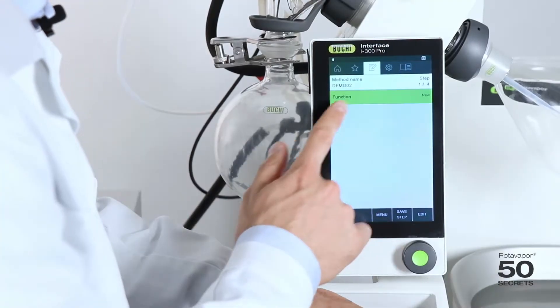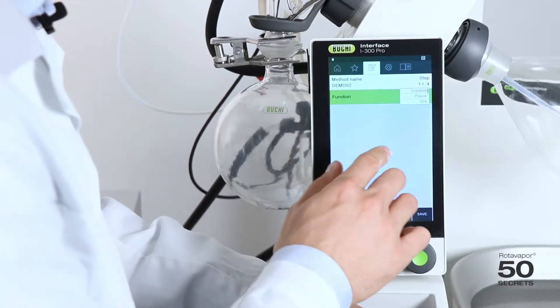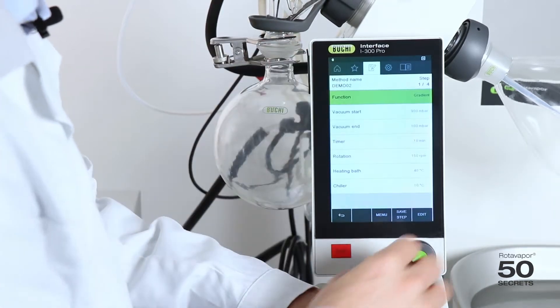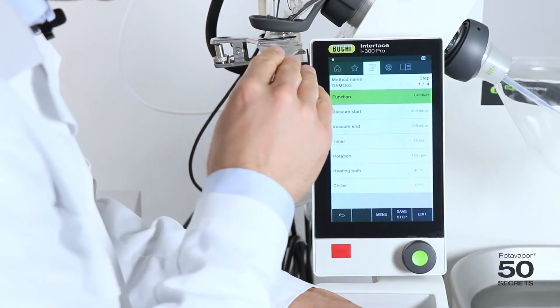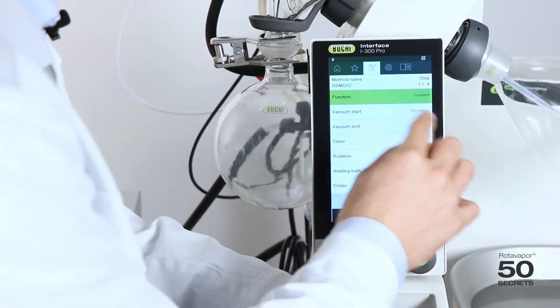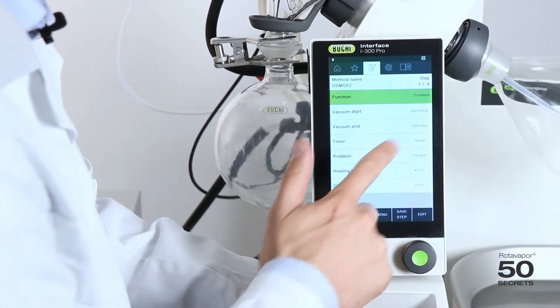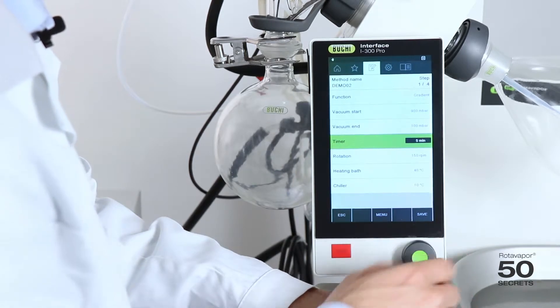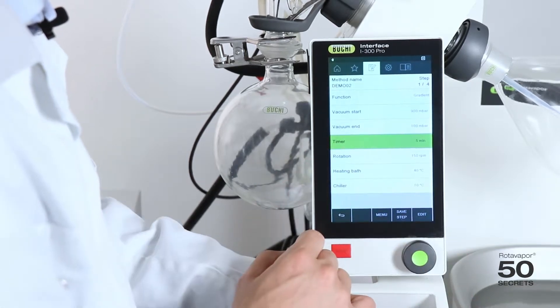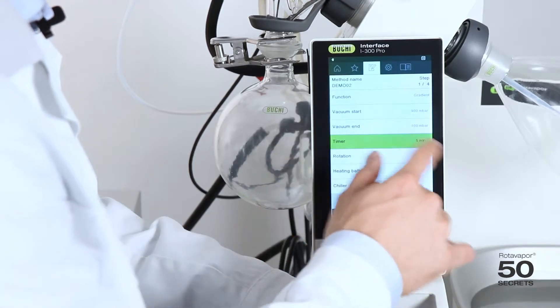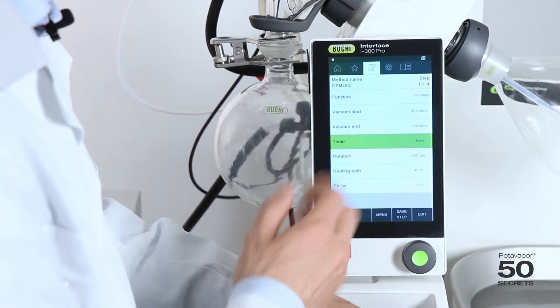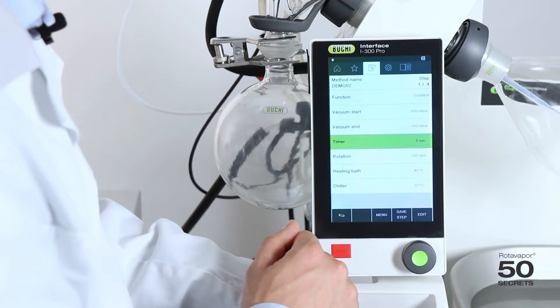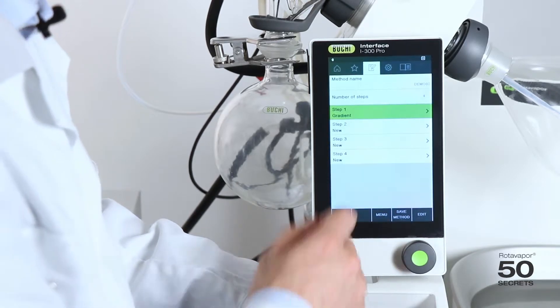The first step would be a so-called gradient. In the gradient we want to start at 900 millibar and then go down gradually to 100 millibar. Let's say this takes five minutes. The rotation speed shall be at 150 RPM. The heating bath temperature at 40 degrees. Save the step.